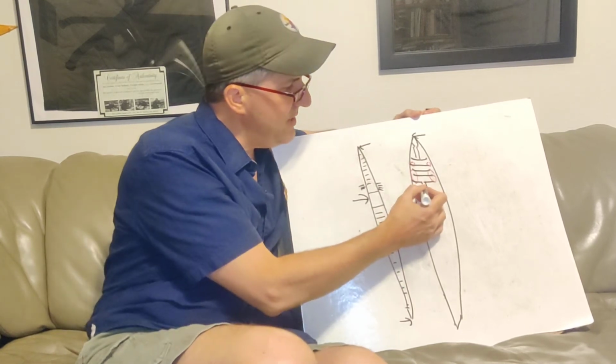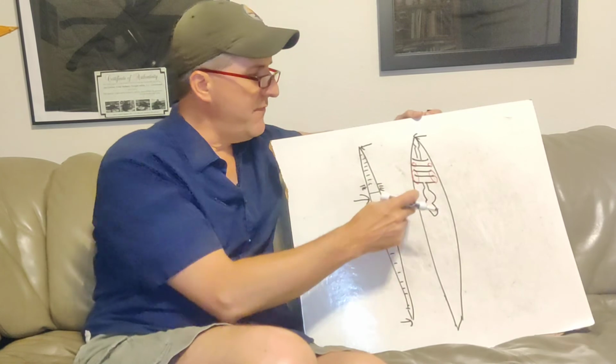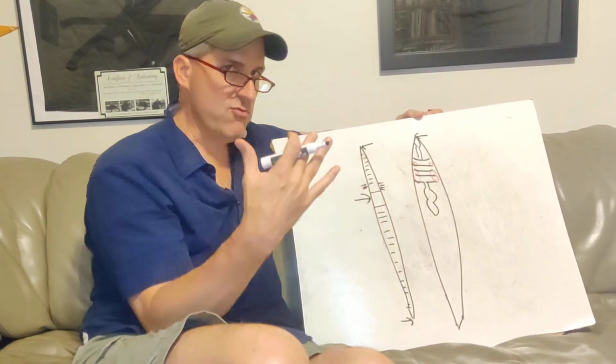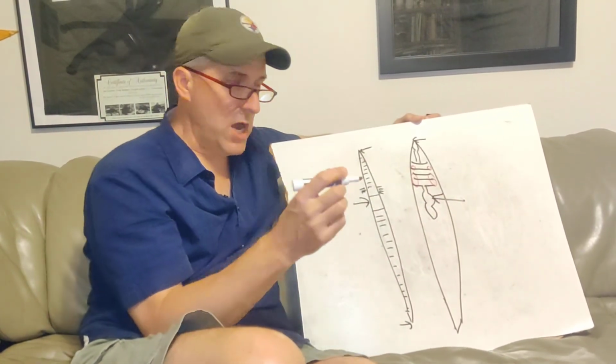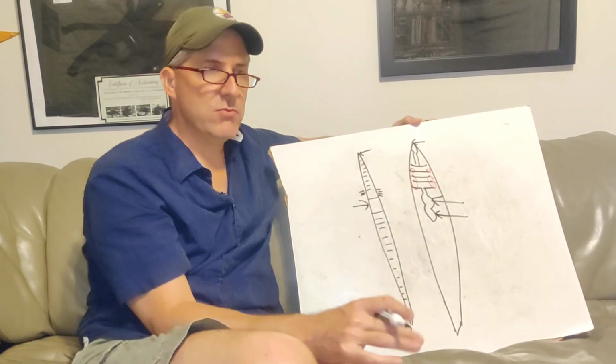From there, then, there would be 2 pouches. They're both muscular. The first pouch, when you pushed on it, would feel soft and gushy. The one behind it would be rock hard. This first one is going to be called the crop. The second one is called the gizzard. Well, why is the gizzard hard?